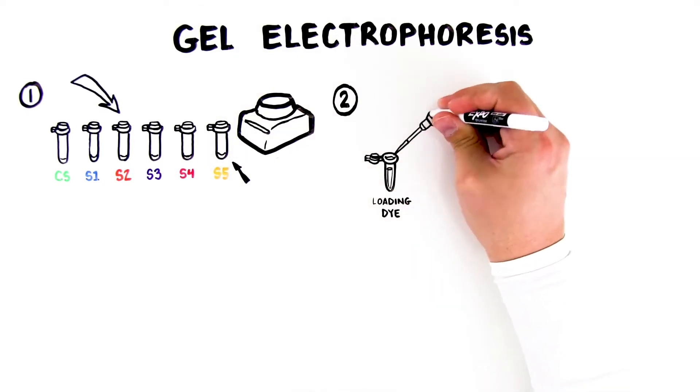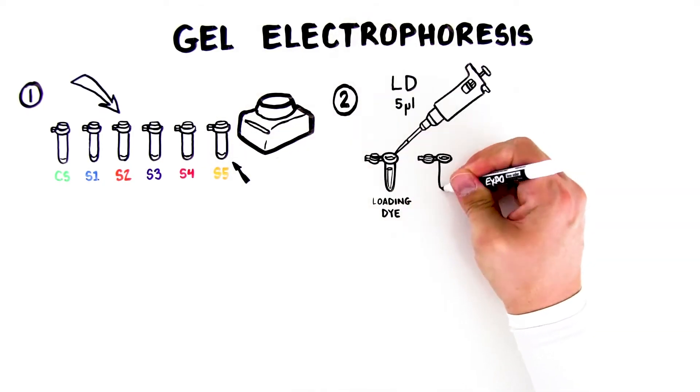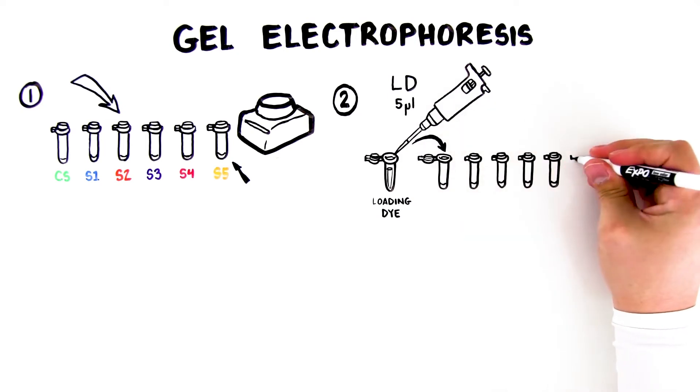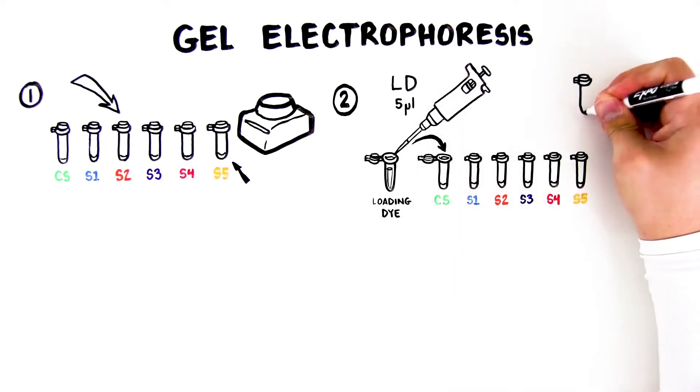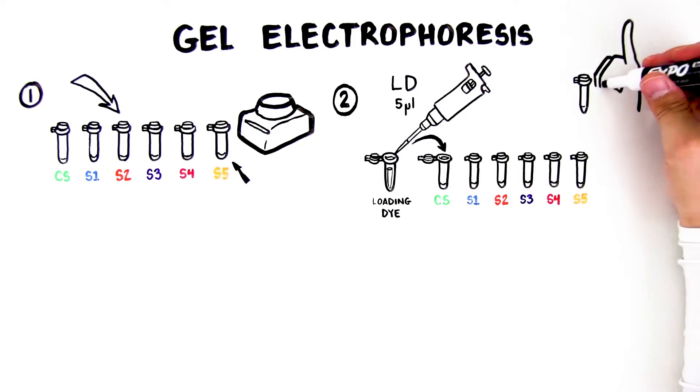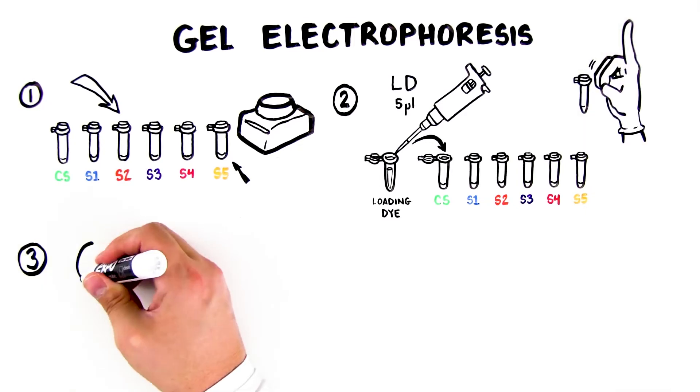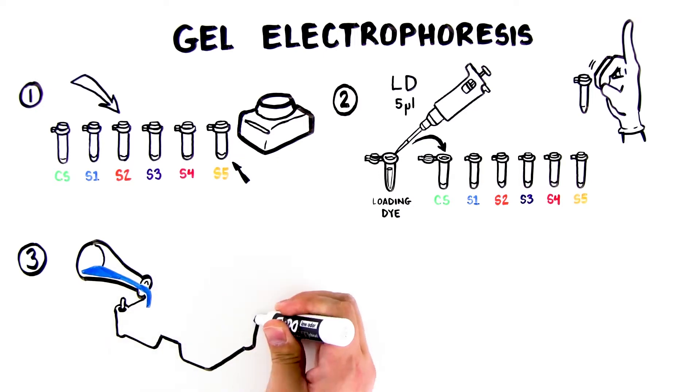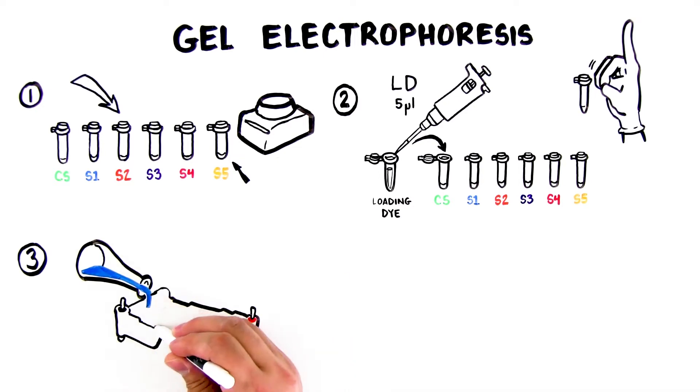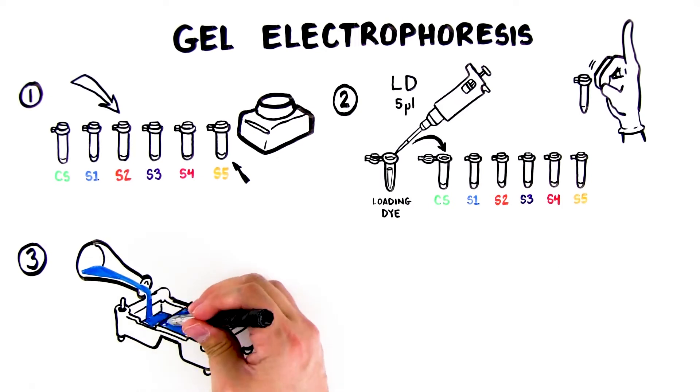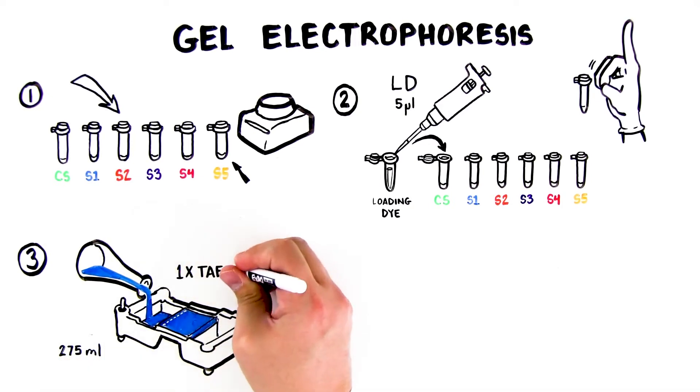Second, using a new tip for each sample, add 5 microliters of loading dye, LD, into each tube. Cap the tubes and mix by gently flicking the tube with your finger. Third, place an agarose gel in the electrophoresis apparatus. Fill the electrophoresis chamber with 1X TAE buffer to cover the gel, using approximately 275 milliliters of buffer.